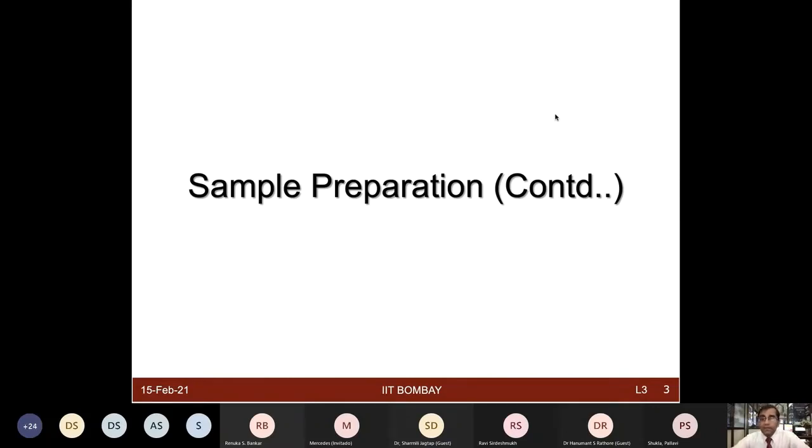That may involve urea lysis or trizol extraction, different ways of TCA acetone precipitation, or a mixture of some of these. We try a variety of things, and also look into publications to see, from which method, what number of proteins people are able to identify. Based on those considerations, we then take one workflow forward.